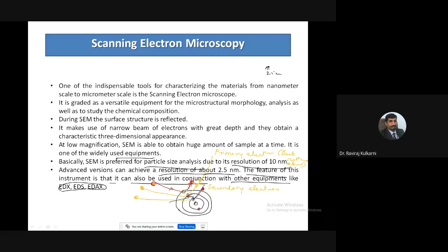While jumping, it radiates certain frequencies, which we call X-rays. So the velocity and kinetic energy of this electron, if you know the wavelength of this X-ray, you can tell what the material is. Three things you can observe here.